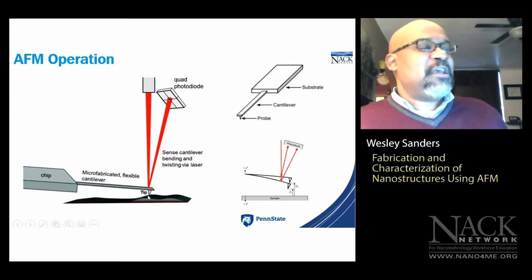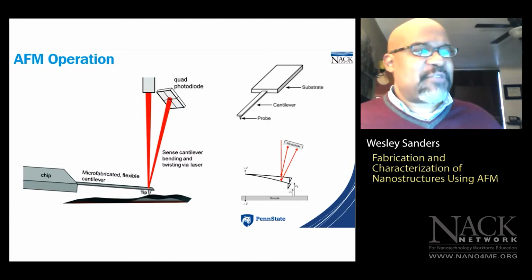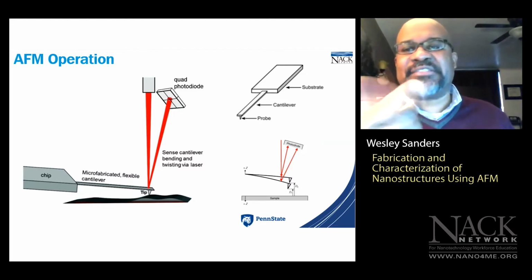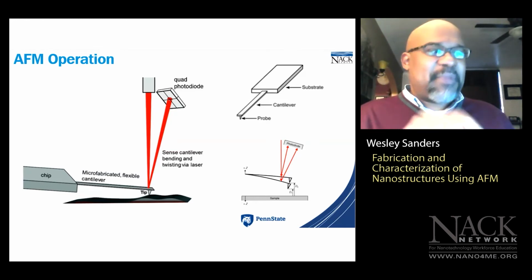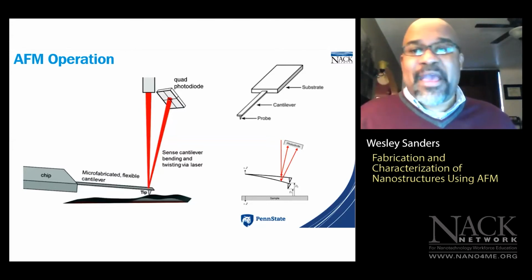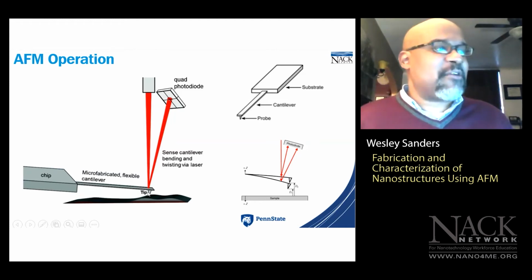surface, okay? So an analogy that I saw several years ago that is used to describe AFM operation is that it's like using Braille. I think that's a really nice analogy. So you use your finger to trace over the Braille text. And basically every letter or character has a specific pattern associated with it. And that's exactly how the AFM works. We have a tip mounted on a cantilever, and the tip simply traces the sample topography.